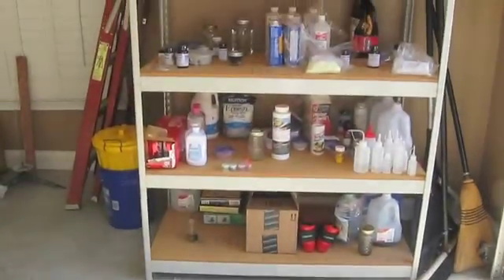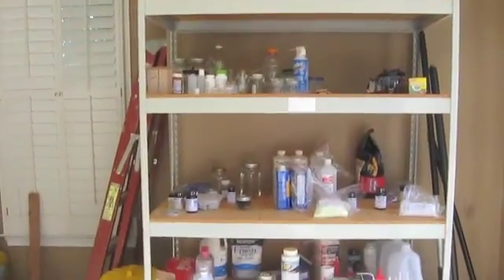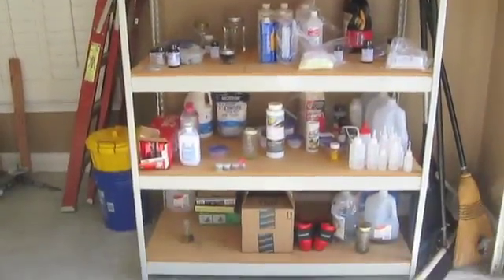Hey guys, and welcome to The Shack. In this video, I just want to talk about some renovations that I'm doing to organize all my chemicals.